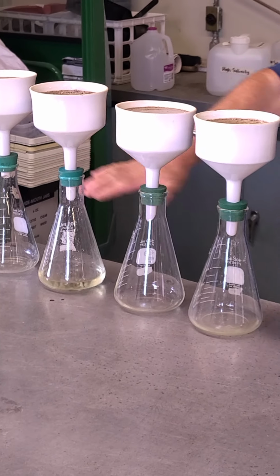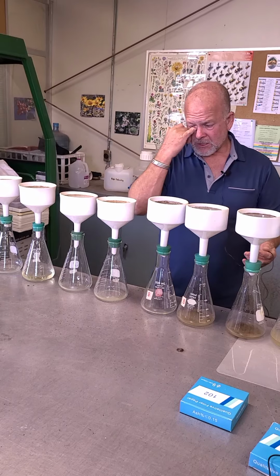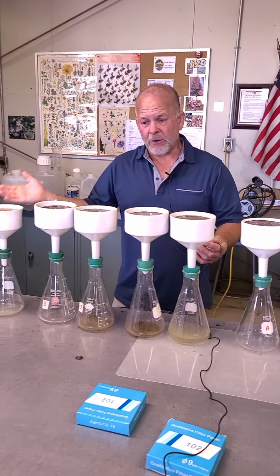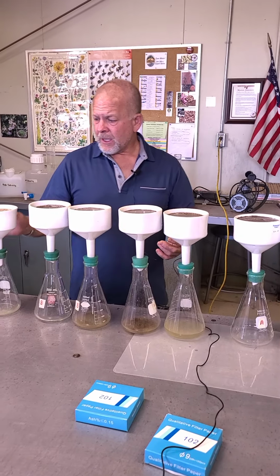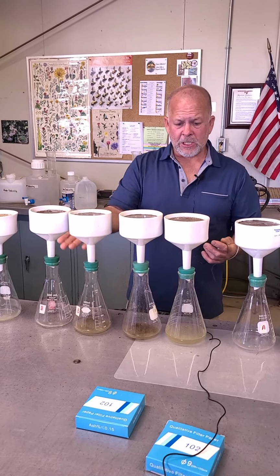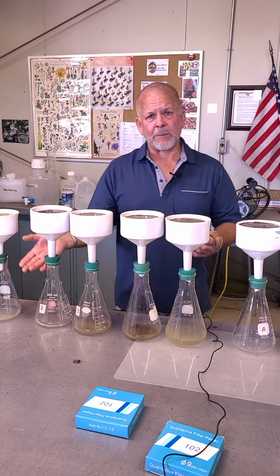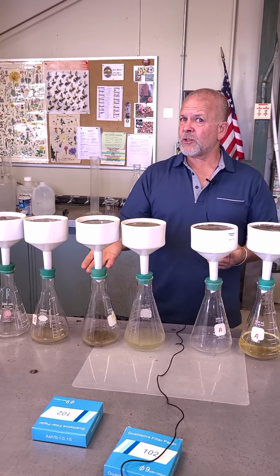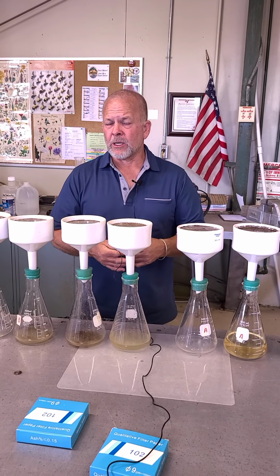You can actually see there's obviously going to be a difference here. It looks like there is something going on with texture. Something, we'll figure it out. You guys will figure it out. Now we're going to go ahead and stop this at this point, and we're going to put the different quantities in there, and then we'll show that, and then we'll record that data, and that'll be presented to you as well. Again, this is still run 1, then we'll go ahead and collect run 2 and run 3, and then you'll get all that data.